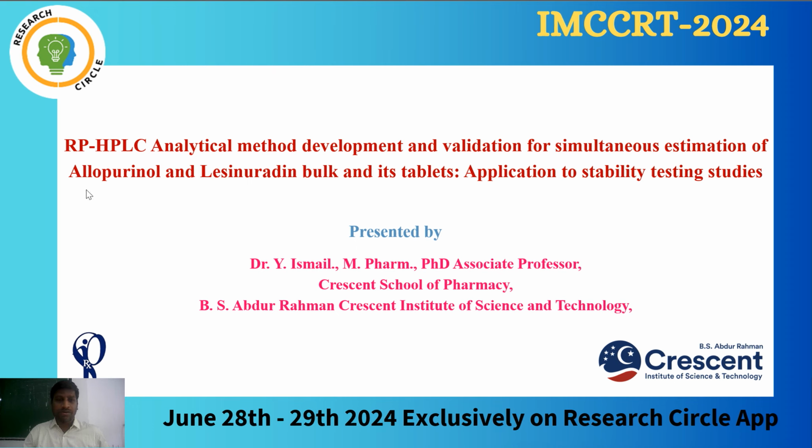Good morning, everyone. My presentation topic is reverse phase HPLC analytical method development and validation for simultaneous estimation of Allopurinol and Lesinurad in bulk and its tablet dosage form.